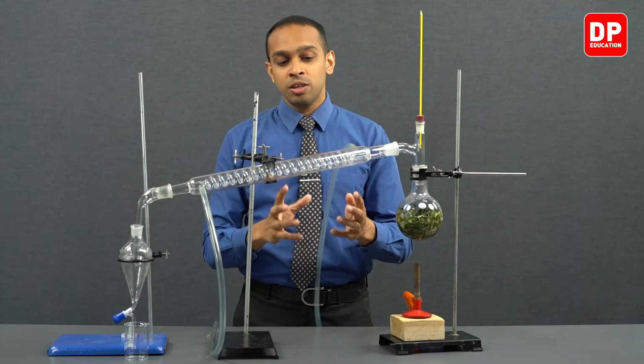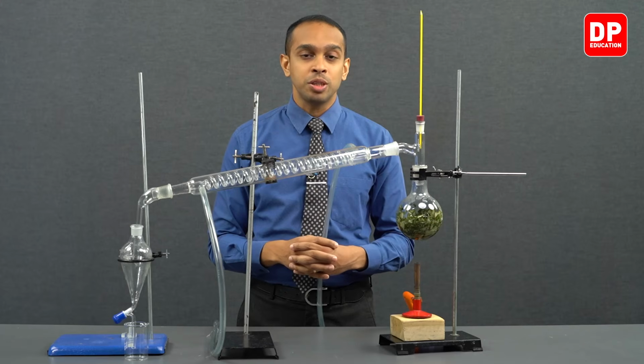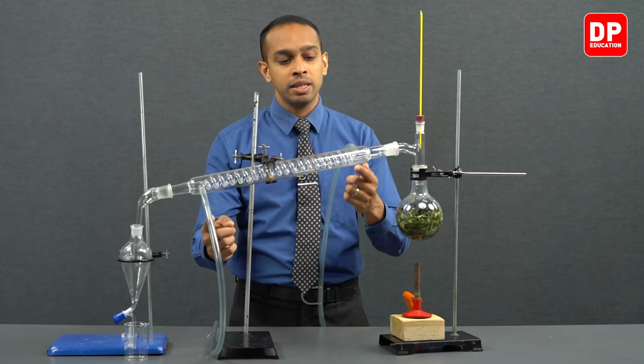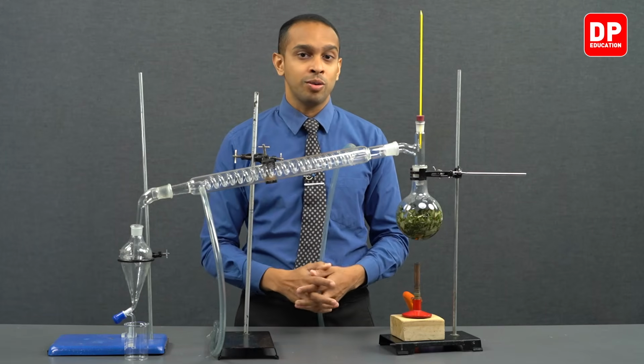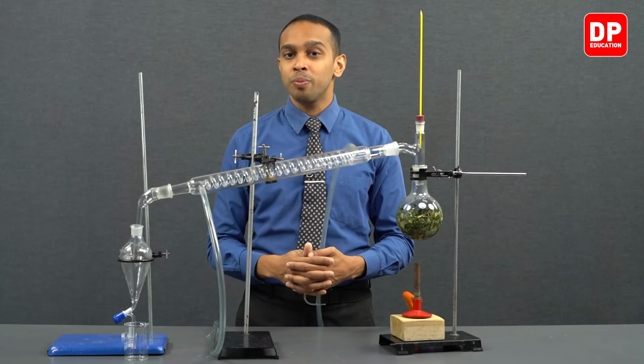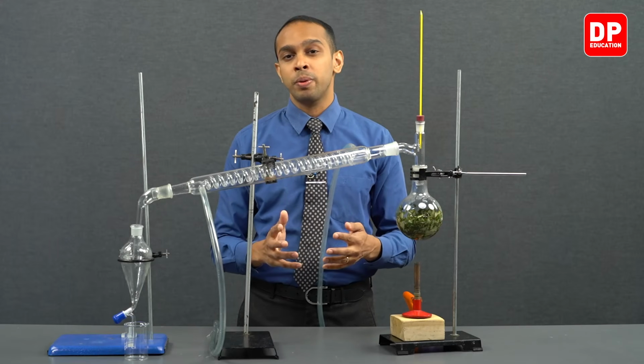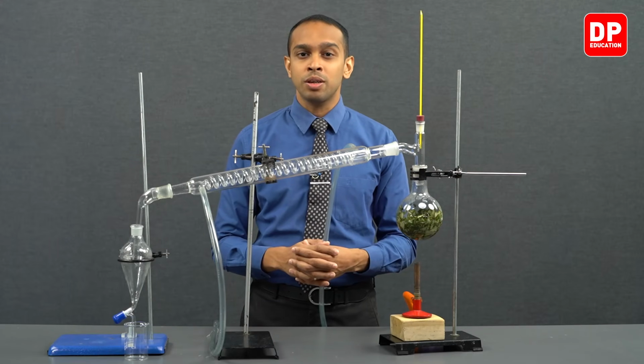So students, you should know the answers to these questions when you are asked why water comes in from this end and is taken out from the top end, to maximize the heat transfer or to make sure that the hottest vapor is always in contact with the coldest water.